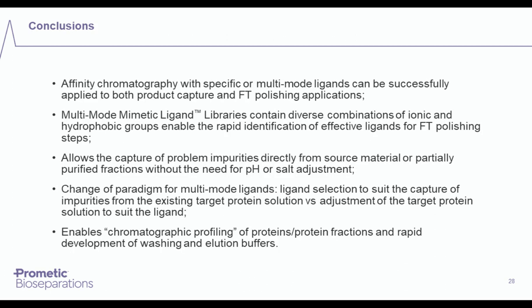So in conclusion, we have shown that the Multi-Mode Mimetic Ligand Library, or MMM plate for short, is a useful tool for rapidly identifying adsorbents for flow-through polishing of the target proteins by removing specific protein impurities. This can be achieved without the adjustment of the starting feedstock, and the diversity of the ligand library allows for the individual ligands to bind proteins under a wide range of buffer conditions.